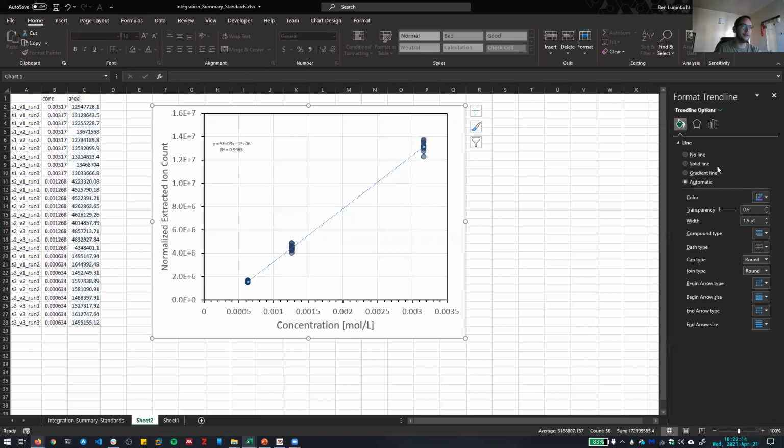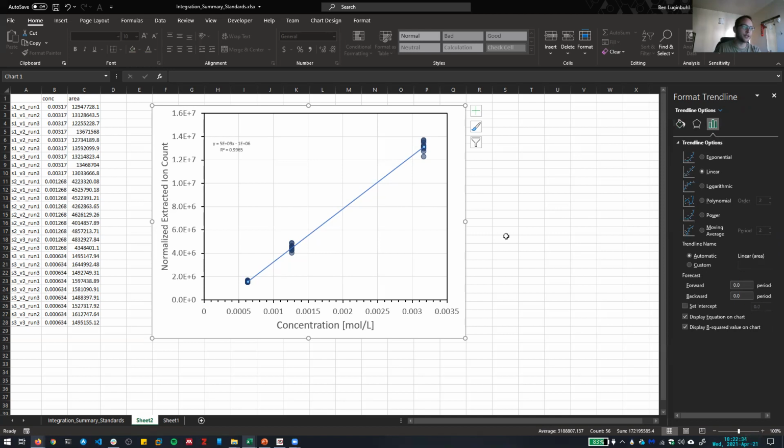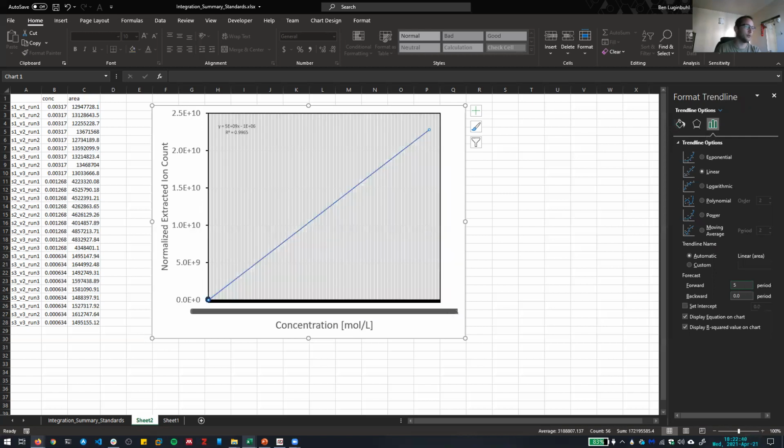Let's do this trend line as well. I want to give that a solid line. I don't want to do any dashes on it. Just want to do that. You can make the color whatever. Blue is kind of cool. And then if you wanted to extend this outside of the data, which for this we shouldn't, because all of our data should hopefully fall within this. But if you wanted to, there's this option with trend lines. If you go to this tab, you can forecast them. Let's try, I don't know. You have to pick, whoa, that's way too many.